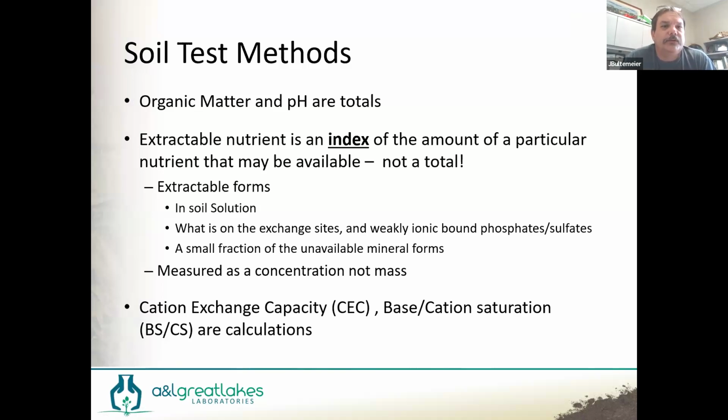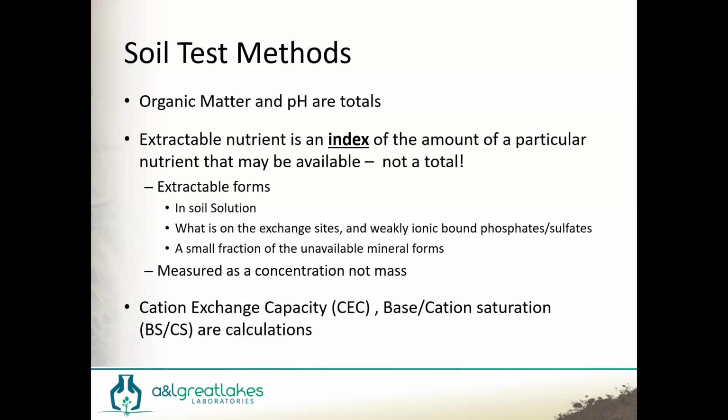So when we're looking at soils, we're looking at extractable nutrients. Again, it's no particular range of nutrients. It's what the acid could pull out. So we are picking up the nutrients that are in the soil solution, the liquid fraction of the soil, what the plants are taking up through the roots. We are measuring that. For cations, we're easily pulling out those nutrients that are held by the cation exchange capacity. Cation exchange capacity is the fact that soils have a net negative charge, predominantly from clay and organic matter molecules, and they hold on to positively charged cations. Calcium, magnesium are the two predominant ones.